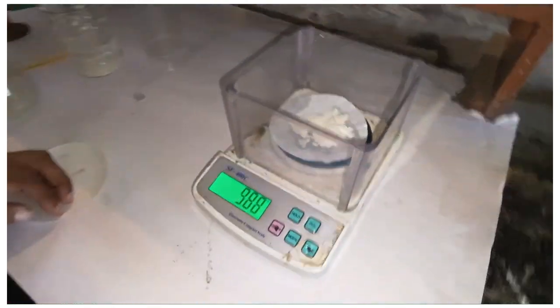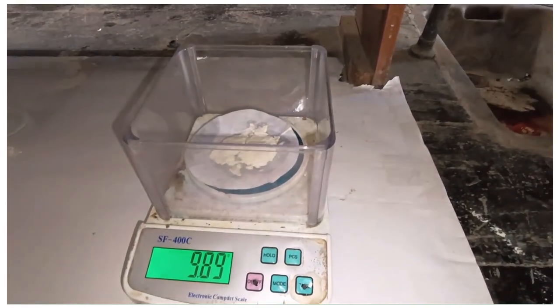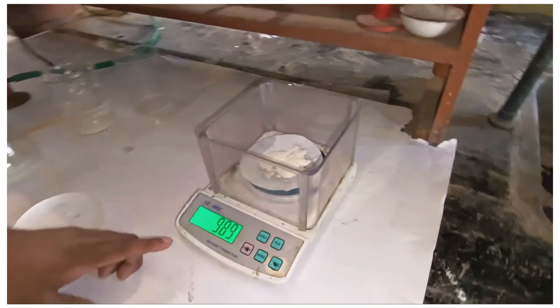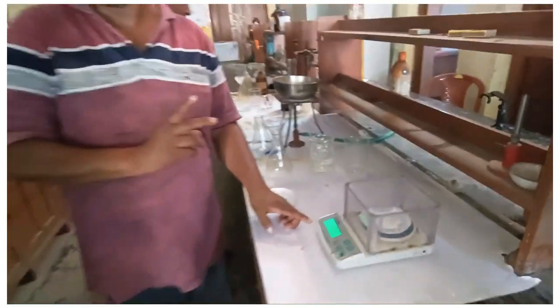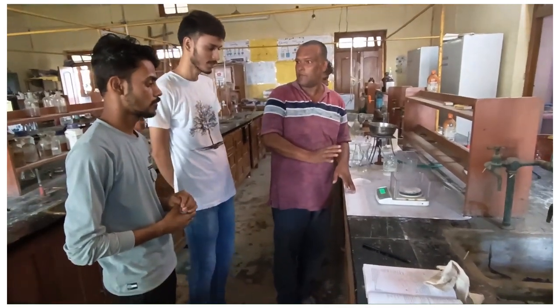How much is the amount? It is 9.89 grams containing moisture. This is 9.89 in 100 ml with moisture, and after drying we will see what is the exact amount. Is it clear? Yes.